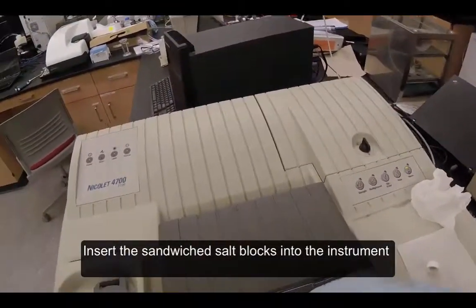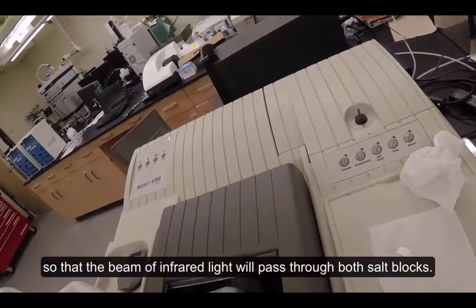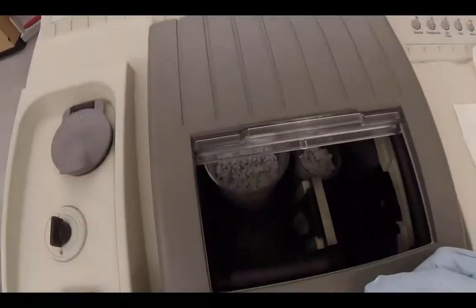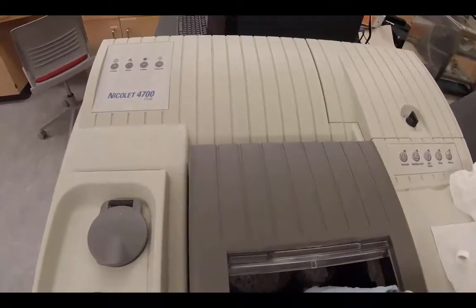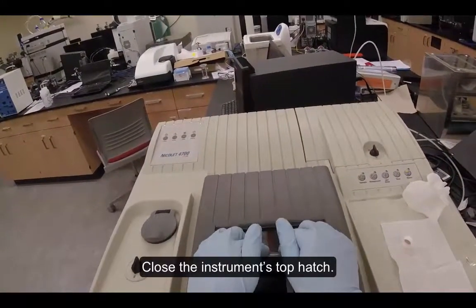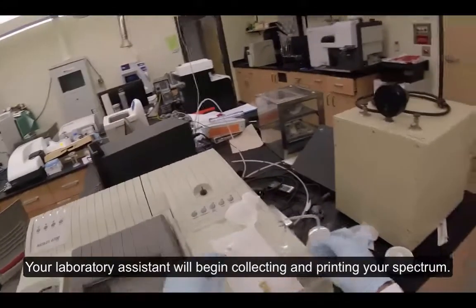Insert the sandwiched salt blocks into the instrument so that the beam of infrared light will pass through both salt blocks. Close the instrument's top hatch. Your laboratory assistant will begin collecting and printing your spectrum.